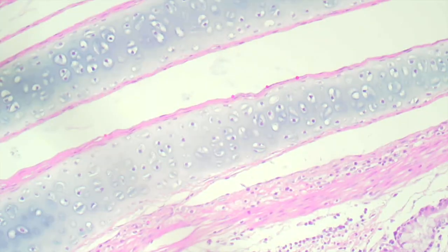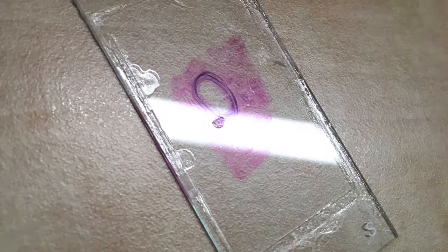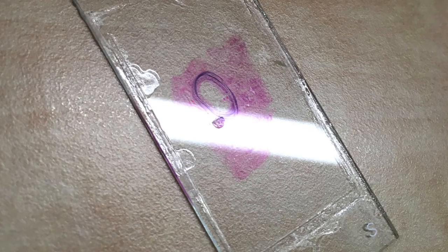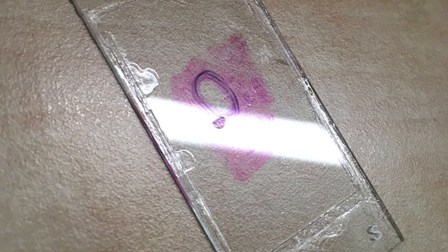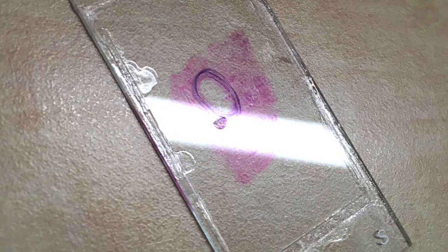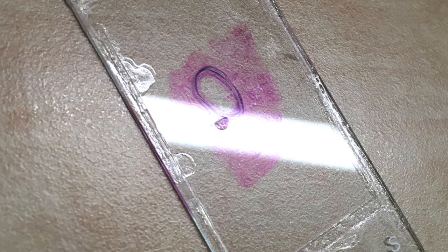While we spend a lot of time learning how to improve our staining technique, it's equally important to remember that all those best efforts to achieve good stains can be rendered useless if you come into problems like this. In this case, just during the final cover slipping, some mounting medium has got on top of the slide, and in the process, it makes it very difficult to see what's going on underneath. So there could be valuable diagnostic or research data that is therefore lost.